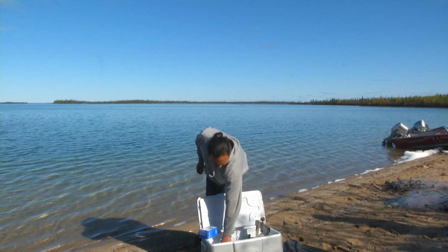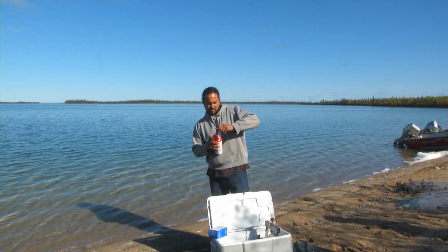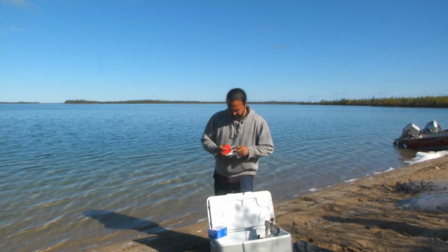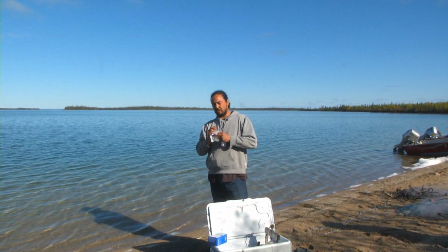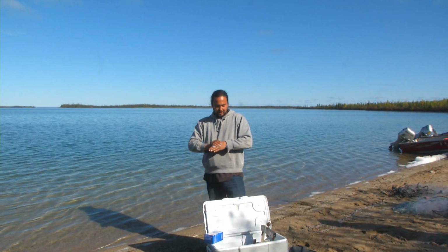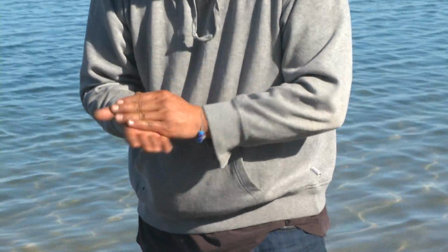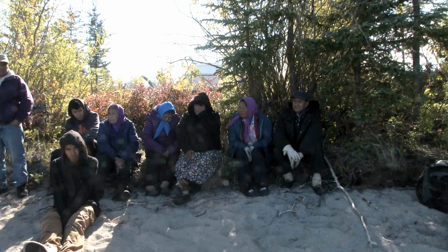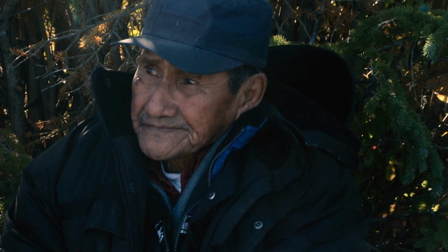So for the first part, before we even start opening any jugs, we have to wipe up, and one of the controls that we have is to reduce the amount of toxins and chemicals that may be going into the readings that would give us a false reading. So before every sample, we'll have to wash down with the wipes, and we'll be using sterilized gloves. For this one, we're going to be using the nitrile gloves.